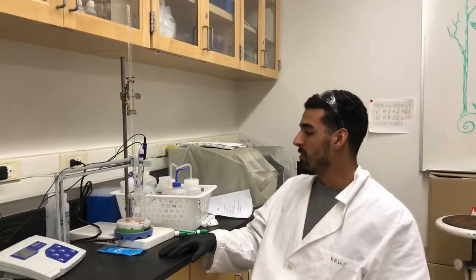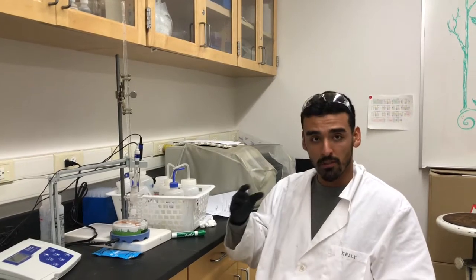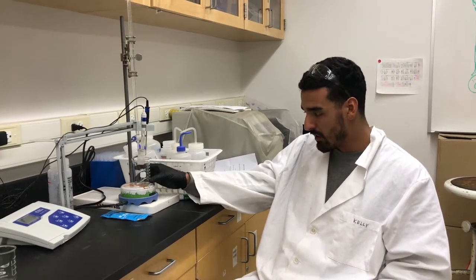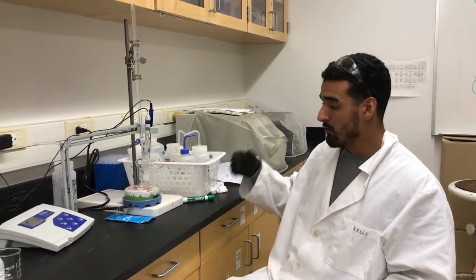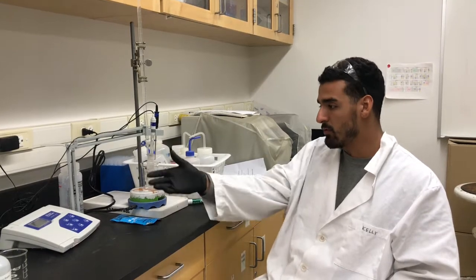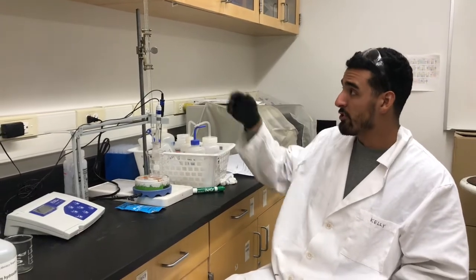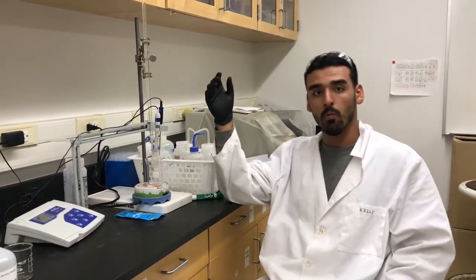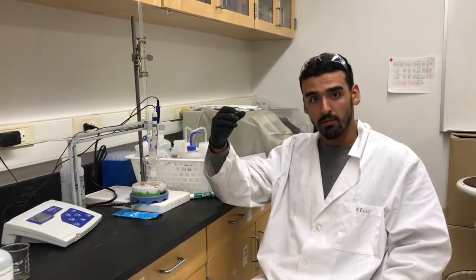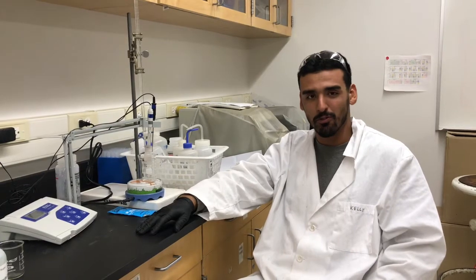So once you're done calibrating your pH meter, what you can do is take 100 mils of your grape solution and put it into your 150 mil beaker. You can throw a stir bar in there, get it ready, and you'll move the pH meter over so you can bring it right next to your burette. In your burette you will be using one normality NaOH. You're only going to really use about 10 mils, so don't go crazy — don't put a whole bunch of one normality NaOH.